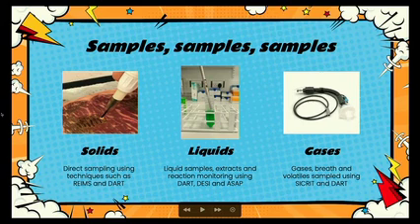The techniques also benefit from being able to handle a wide variety of different samples. So techniques such as REIMS can cope with tissue samples. So REIMS, rapid evaporative ionization mass spectrometry, started life as a way of analysing the smoke that's produced from an electrosurgical knife in cancer surgery.